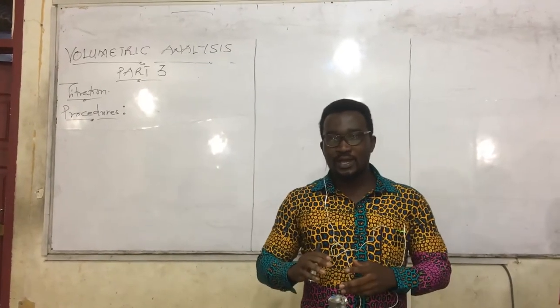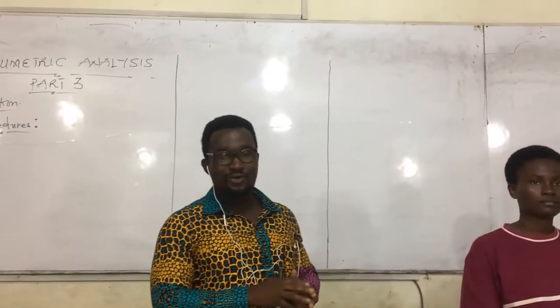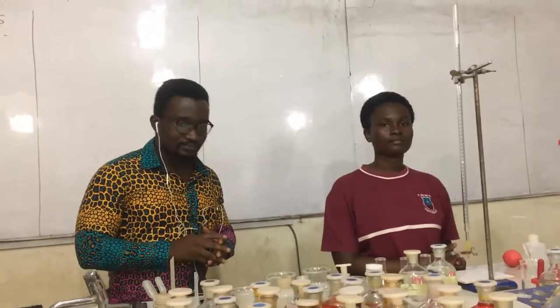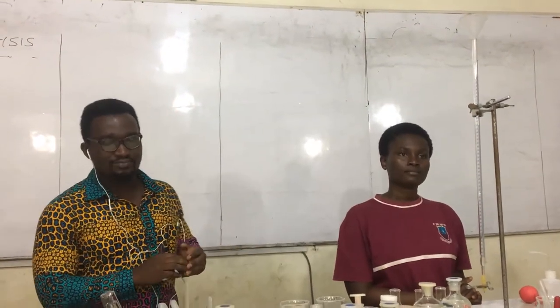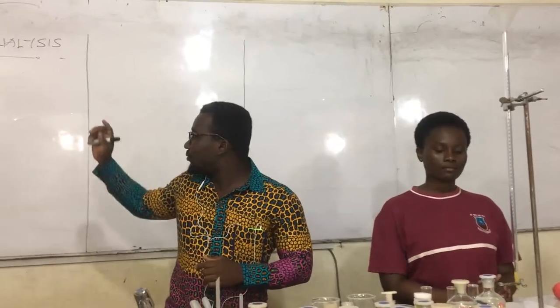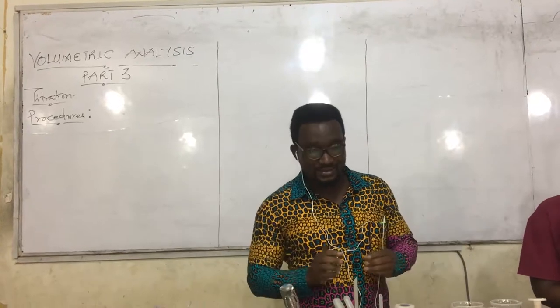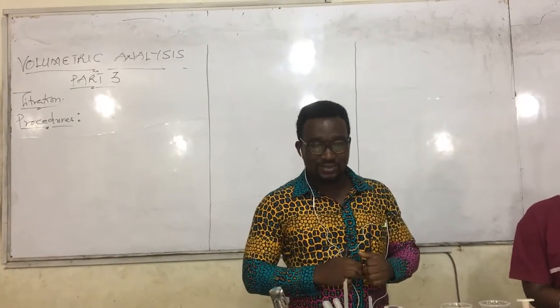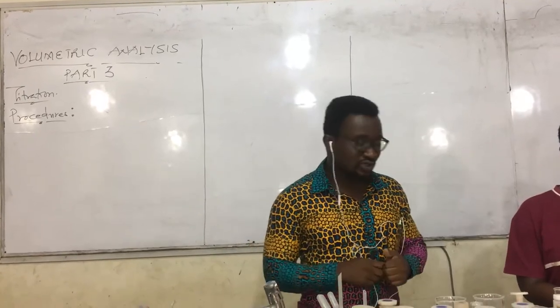Therefore, I will introduce our madam who is in our laboratory right now, who will be helping us go through the practical act of titration. She is Madam Jennifer Abena Prempeh. Quickly, we are going to focus on the procedure so that we know the rudiments, the practical act, what is needed, and what is expected of us in the course of titration.